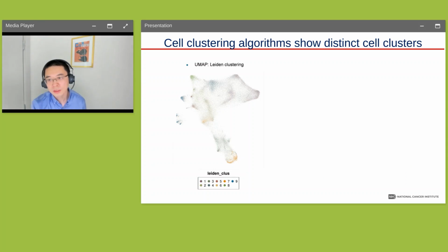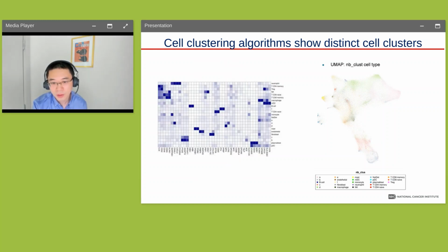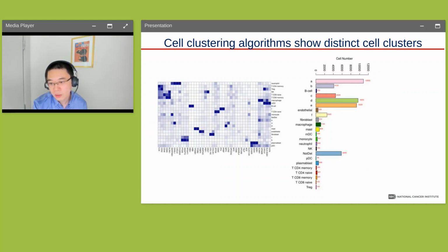This spatial technology also allows us to cluster cells in the tumor microenvironment into different clusters in an unbiased way. With this clustering algorithm, we were able to annotate and identify the T cells, the leukemia cells, and the myeloid cells. We can see they harbor very dramatically different transcriptomes, and the cell numbers also vary. And we are in the process of connecting the different modalities and the spatial information with our single cell data set.